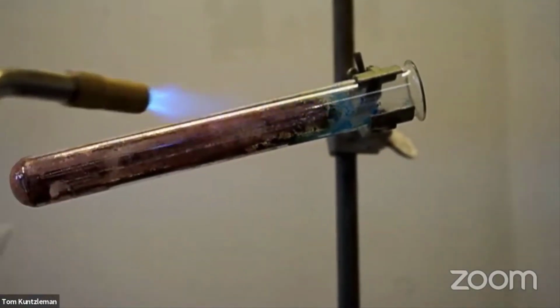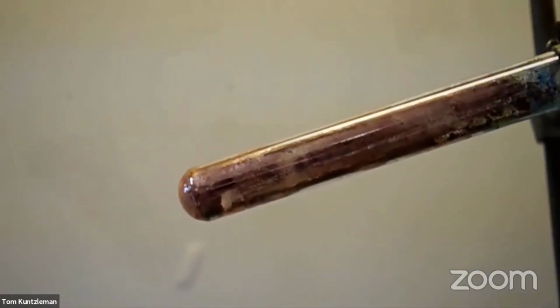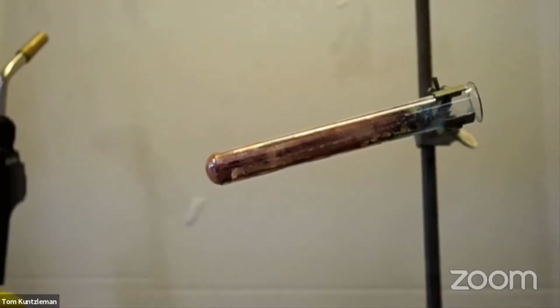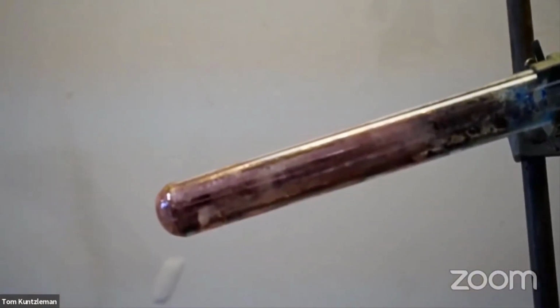Yep, all the way up the test tube. That's really neat. So by heating copper formate, we were able to change the copper-2 ion back to some beautiful, shiny copper metal right there in the test tube.